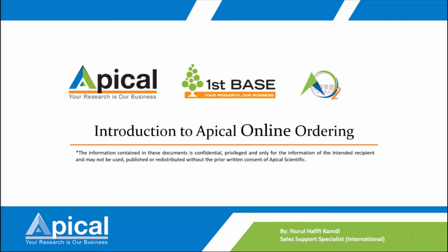It will show you a double peak, and you will find that the sequence beside it should be a good sequence, in blue QV, and then it will have a peak that is showing double peak. Then that will be the SNP that you want to refer to. I hope I answered your question.